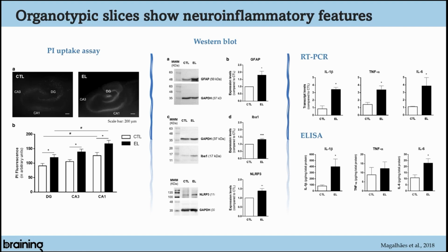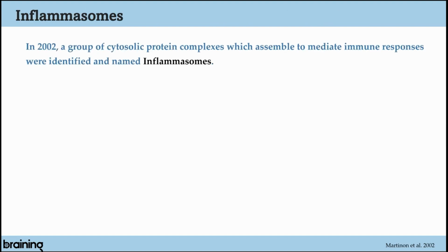And from all these results, we concluded that these slices indeed show signs of neuroinflammation, and our attention was drawn to this. We had an increase in these epileptic-like slices of the expression of the NLRP3 domain. So what is the NLRP3?